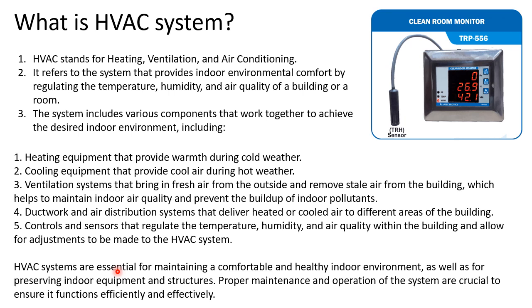So if you have to incubate at room temperature, then you have to check whether the clean room has the room temperature or not, whether it is at 27 degrees or not. You have to check that, otherwise you will not get the desired result for microbial growth, correct? Then proper maintenance and operation of the system is crucial to ensure it functions properly, efficiently and effectively.